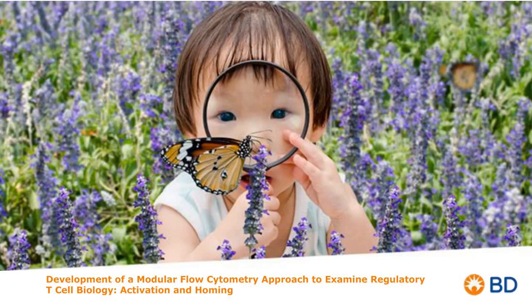Okay, next question. I have an 18-color instrument. If I were to use a modular approach to panel design, would I just save the same fluorochromes for my drop-in panels? That's another great question. So if you have an 18-color instrument and you have the corresponding 12-color markers on there, you could choose to save the same fluorochromes. However, you know the 12 colors work together very well, but if you have an 18-color instrument, you may have additional capabilities.